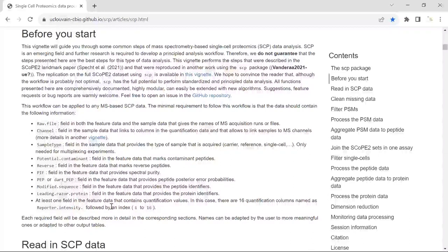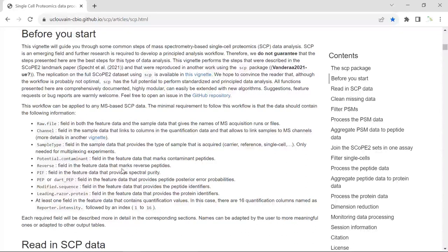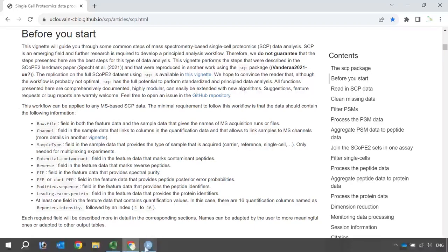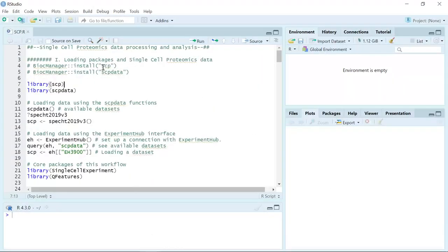For the data we are going to use for this video tutorial, the reporter intensity has 16 channels. I only did a very short introduction here, and the online tutorial contains all the details. If you are going to analyze your single-cell proteomics data, you should read this online tutorial in detail. So now we can go to RStudio and show you how to load the packages and also how to load the single-cell proteomics data set.